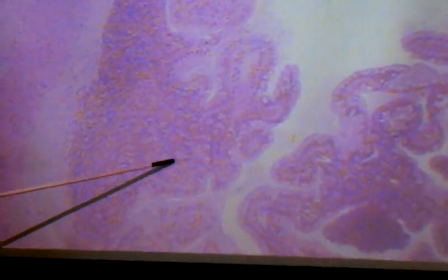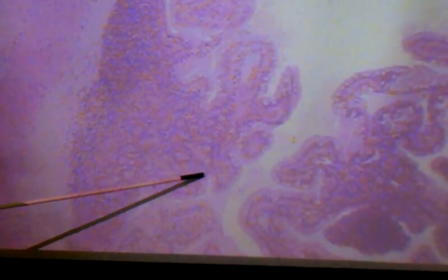I'm not going to say connective tissue. But if we were to zoom in on this, the nuclei of the lamina propria connective tissue are relatively far apart in these areas. Here it's very, very dense. It's also a little bit darker in this area. From here to about here, appears as though this is MALT.